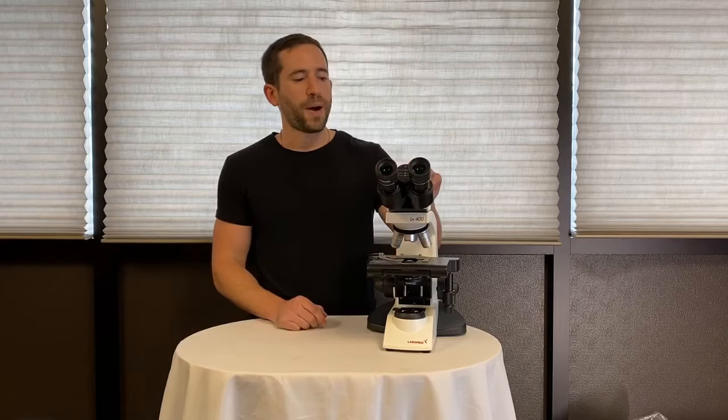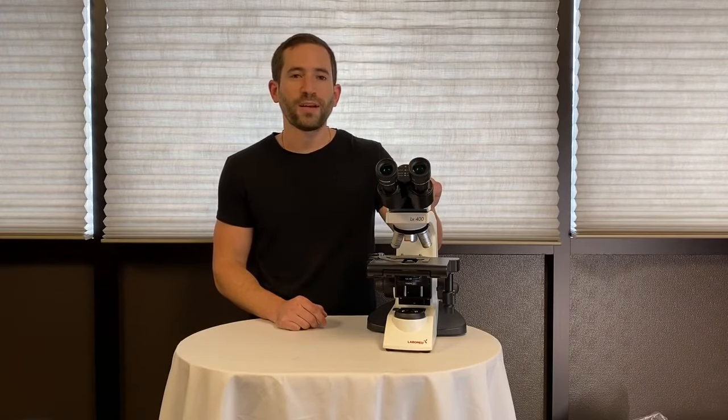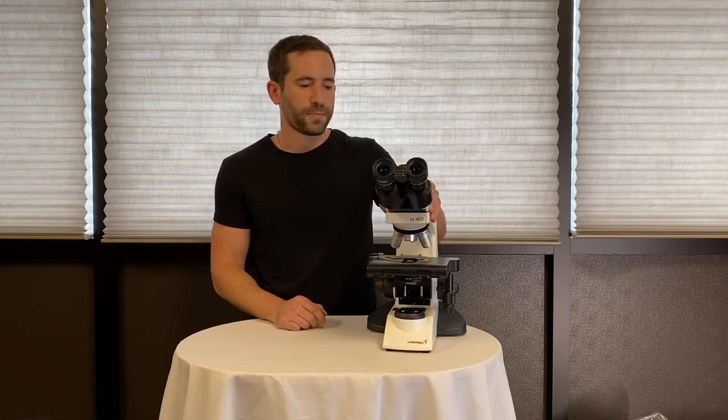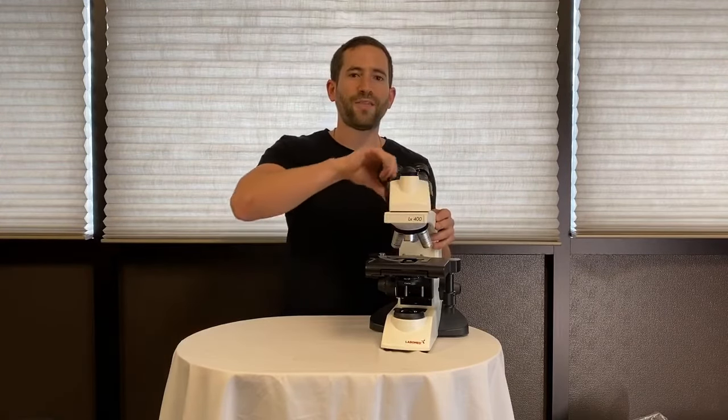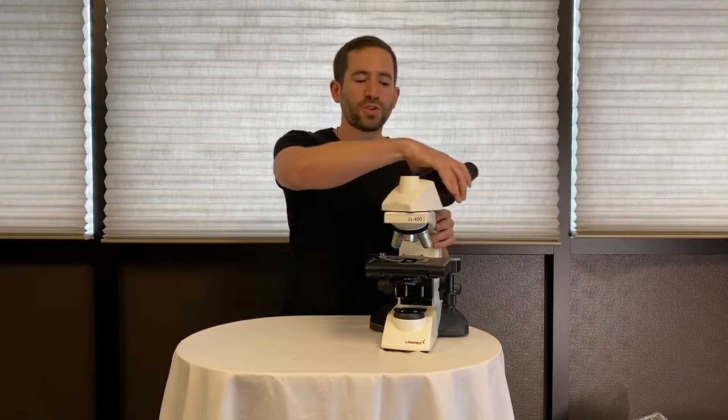It's offered in a binocular or trinocular viewing head so you can add a camera. The head rotates 360 degrees without having to loosen a thumbscrew for storage or sharing.